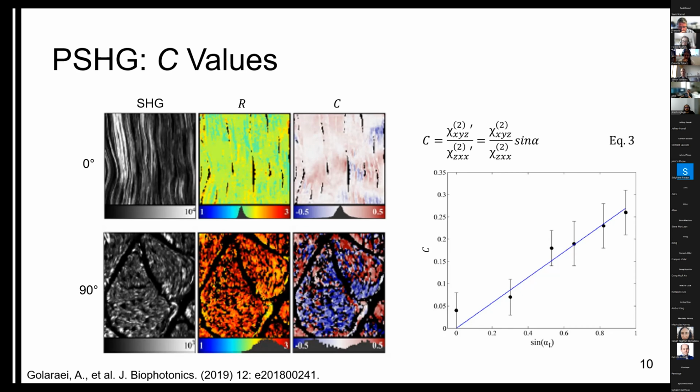I see. And then my question is, what's the size of this image? Oh, I am so sorry. I didn't even notice that. I did not include that. So typically they do 110 microns by 110 microns imaging, so I would assume that's what that image is. Okay.